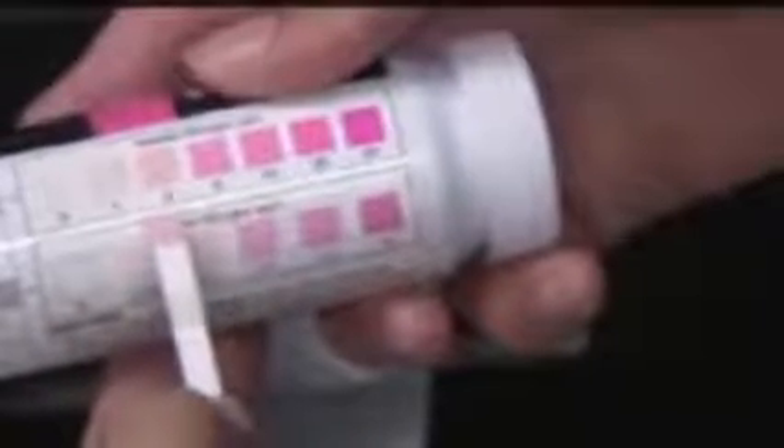Reading our water sample, it's two parts per million nitrate. Record your data and throw your test strips in the trash, and you're done.